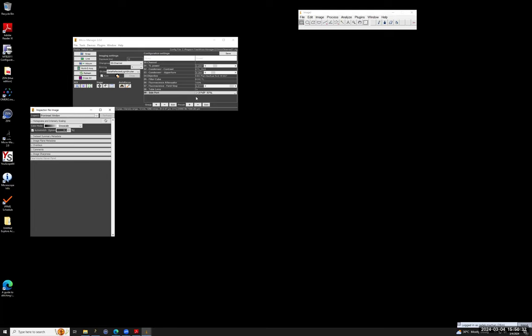And of course, I can set every component here manually. There's another feature: I can group some of those settings into one higher level setting. So I have here something that I called channel, and that allows me to select different preset channels. I have different fluorescence channels which correspond to the different fluorescence filter cubes, plus different channels for different transmitted light contrast.